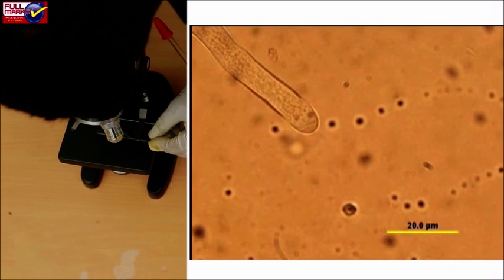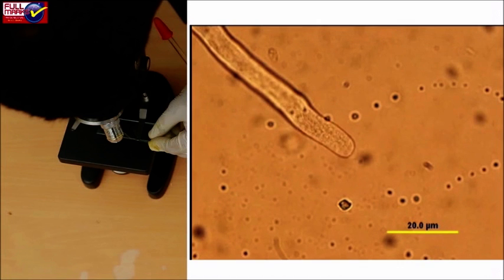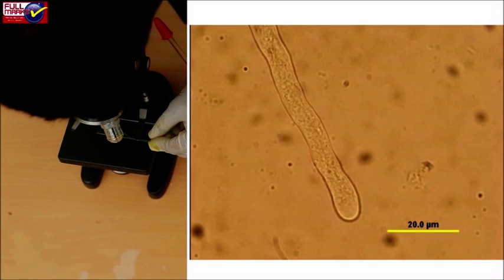The thin intine protrudes out through a germ pore into a slender pollen tube. Sugary substances secreted by the stigma stimulate further growth of the pollen tube which gradually elongates.